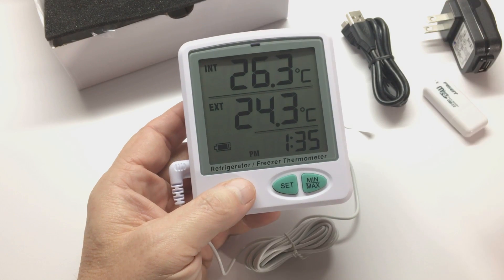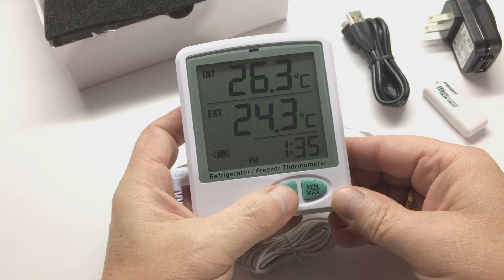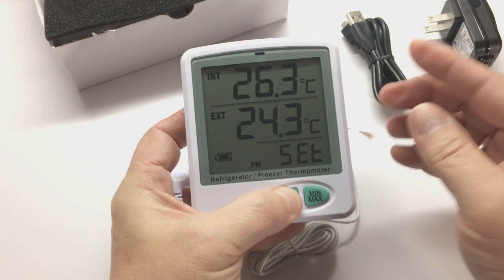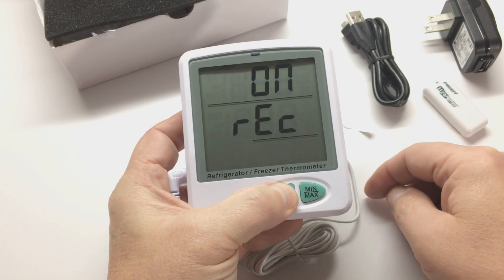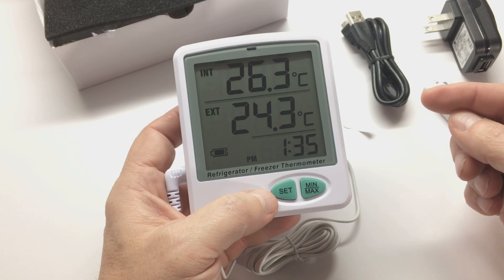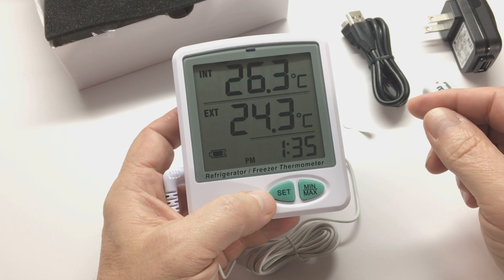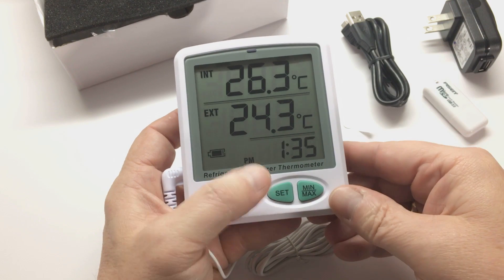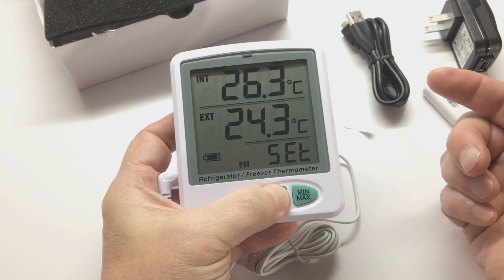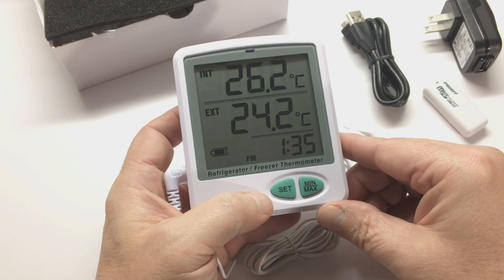When you want to take the unit and set it up to record data, depress the Set button for about six seconds or a little longer until you see 'on record' on the screen. We are now recording data — every 15 minutes a record will be saved to the SD card. If you want to stop recording, press the Set button again for six or a little more seconds until you see 'off record' on the screen, and now we are stopped data logging.